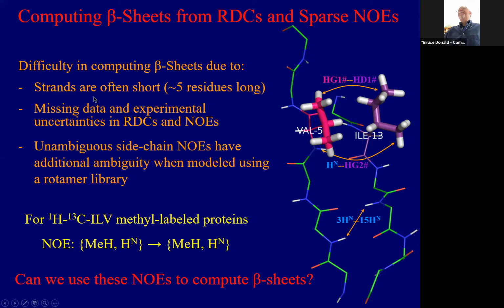So in short, it can be tricky to estimate the alignment tensors of things that are very short. There tended to be some missing data. It tended to impact these a bit more than some other structures. And there's an interaction between packing the two strands based on a distance when the distance depends on the assignment to a rotamer in a rotamer library that you're assigning at the same time, so you have some choices there.